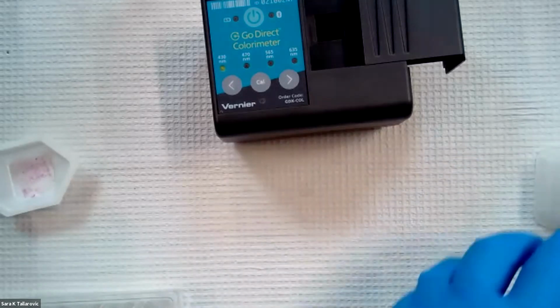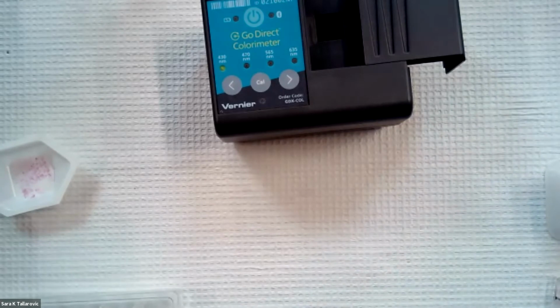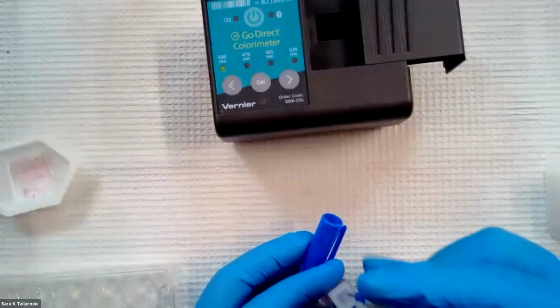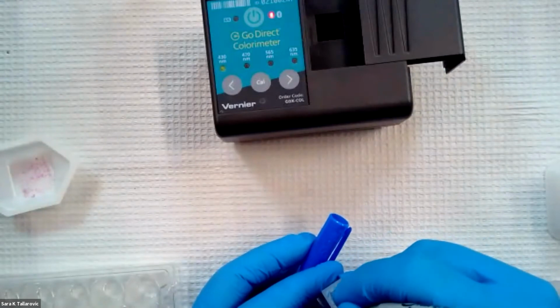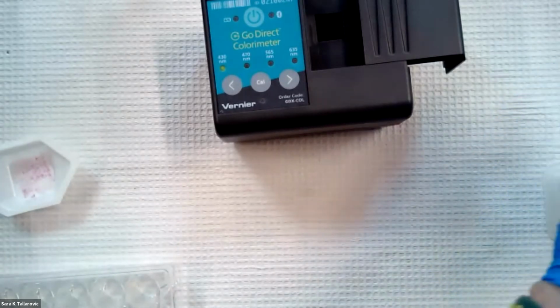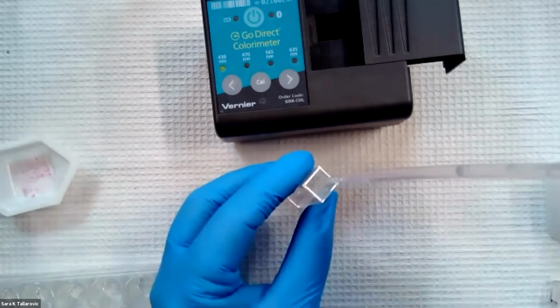Now, in order to save cuvettes, you can certainly have your students drawing the fluid in and out of the same cuvette. That's perfectly fine. For our purposes, I'm just going to prepare separate cuvettes today. As we do this, bear with me, this is my 3% sample. And if you have any questions at this point, feel free to drop them into the chat. I know that Angie and Colleen are monitoring the chat.